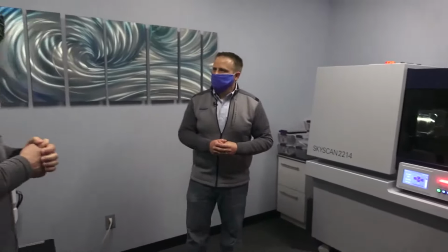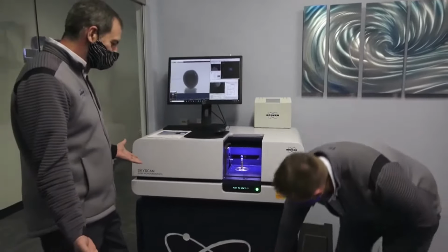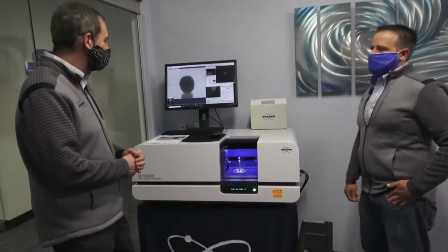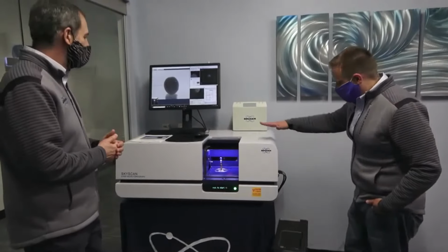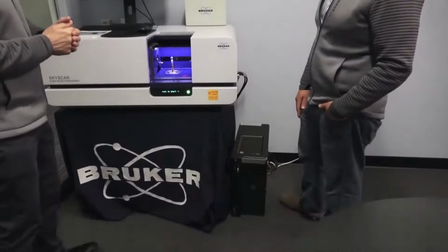Okay. And then over here we have what looks like a benchtop. Now I'm guessing that you must have a lot of extra equipment somewhere else, maybe in another room? This is the whole instrument. This is the SkyScan 1275. Okay. So it looks like we've got the instrument and maybe a pretty beefy computer.